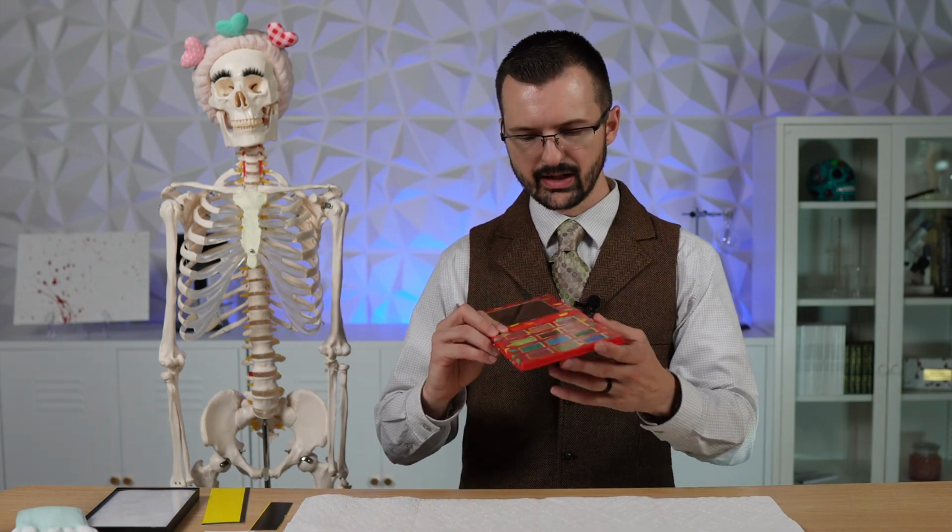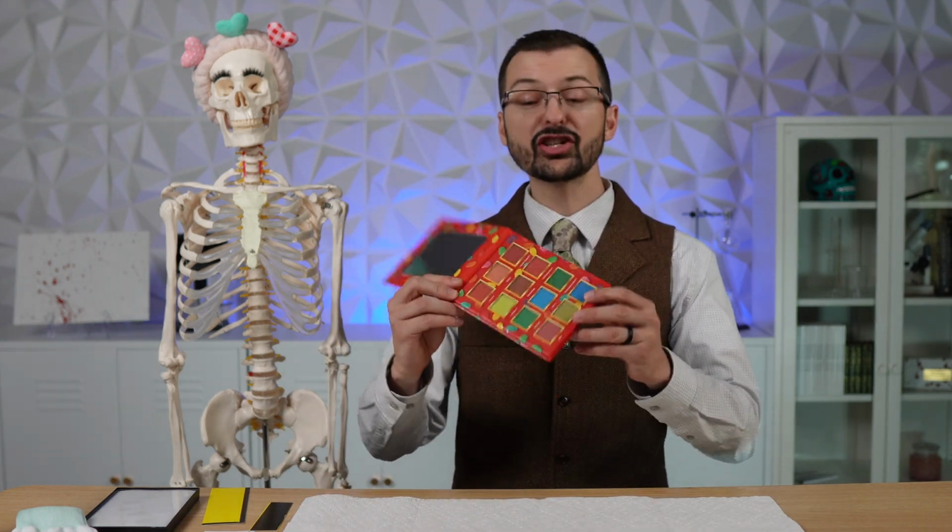Hi everyone, welcome to another episode of The Science Detective. Today we're gonna explore a unique and glamorous twist in forensic science. I was recently at a store helping my daughter shop for makeup, and I saw this really colorful eyeshadow palette, and I had the thought, I wonder if I can use that to develop fingerprints. From face powder to brushes, we're gonna see if these everyday beauty products can help us reveal hidden fingerprints. So grab your mascara wand and let's brush up on some forensic science.